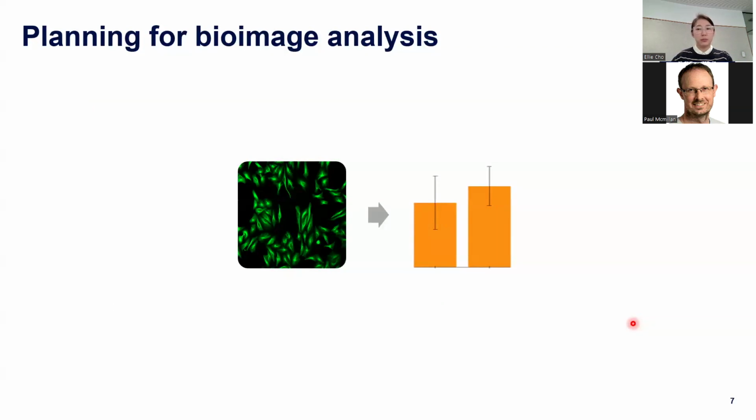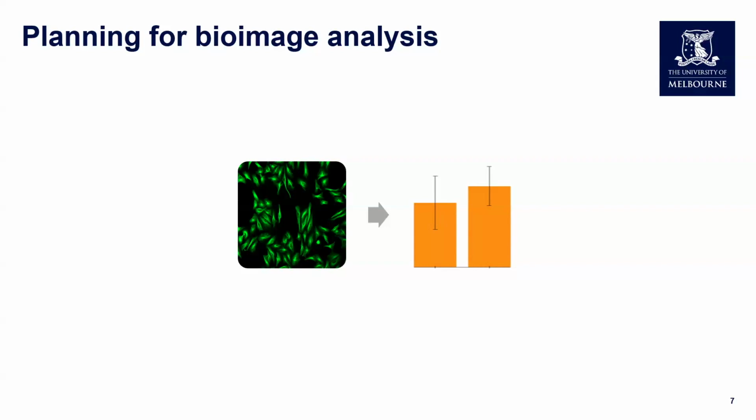This number crunching process can be simple and straightforward if we have ideal microscope images that are already optimized for it. But in many cases, we are seeing researchers trying to analyze images that are not really suitable for certain quantifications.